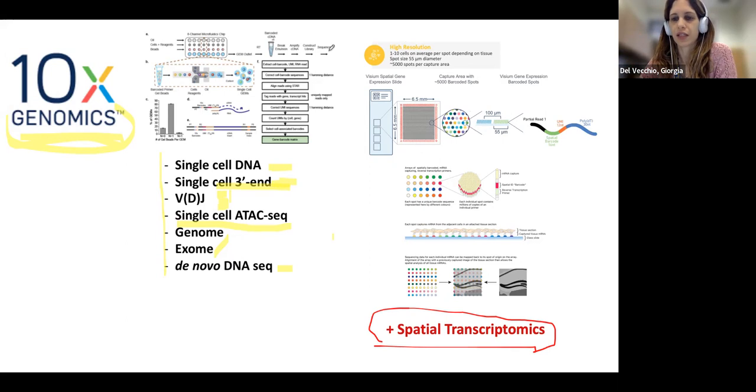So you can cut a thin slice of your tissue, put it on this support, and that has all the adapters attached to it.